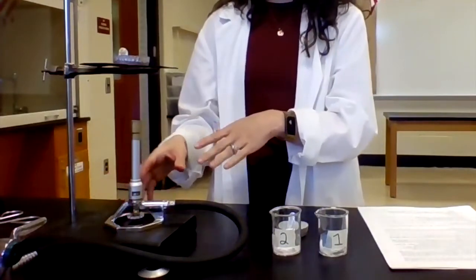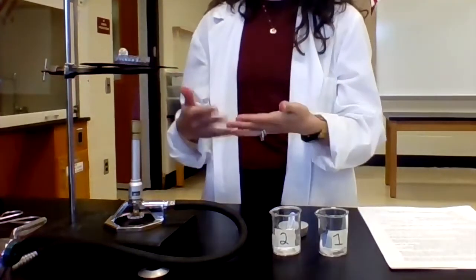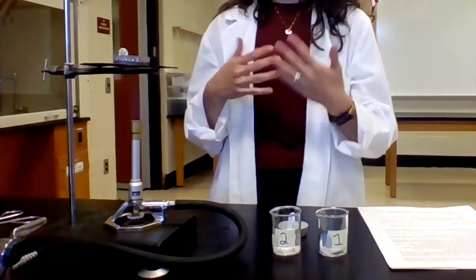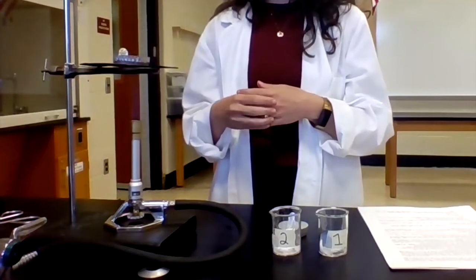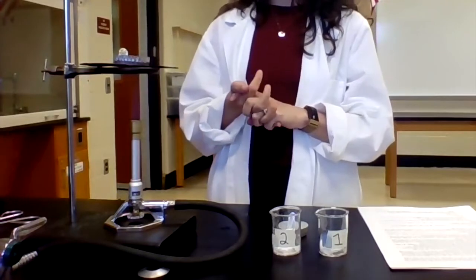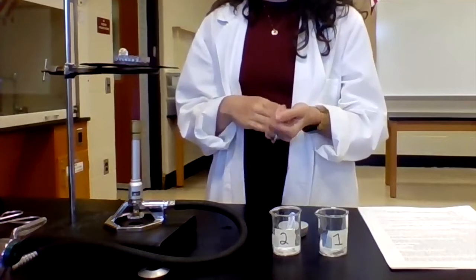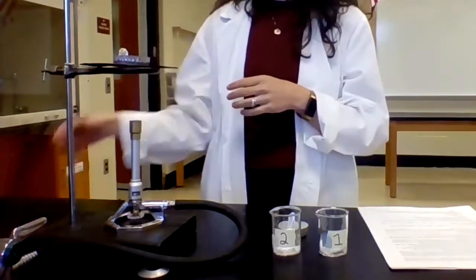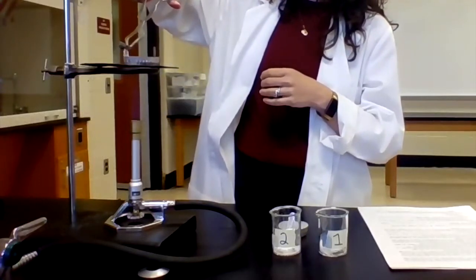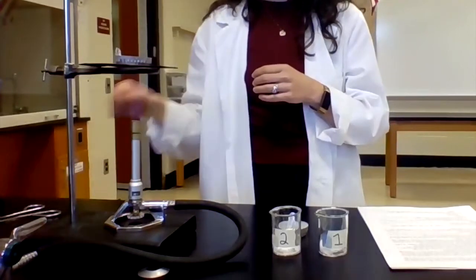And I'm going to let this go, just like with the hot water bath, for about 2 minutes to see if it melts. If it melts, that tells me that it has a moderate melting point, making it likely to be polar covalent, but not necessarily. Some polar covalents do have higher melting points, or certainly ionic if it doesn't melt. So test this for a couple of minutes. When I'm ready to take it off, I'll use my crucible tongs. Obviously, it's going to be warm, so I can get it off of the iron ring.